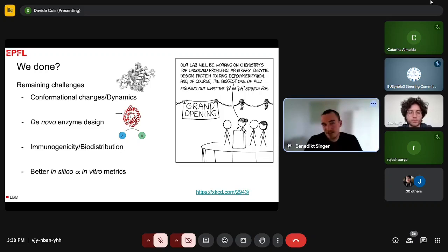And you're like, well, I had this really good design, and it was supposed to work according to all the prediction tools I used, and yet it just doesn't work. And then there's always this question when we use this big 96-well protein expression and purification: is it because we just throw away things which actually would be fine in different conditions and different media, or is it just that these metrics are not working that well?